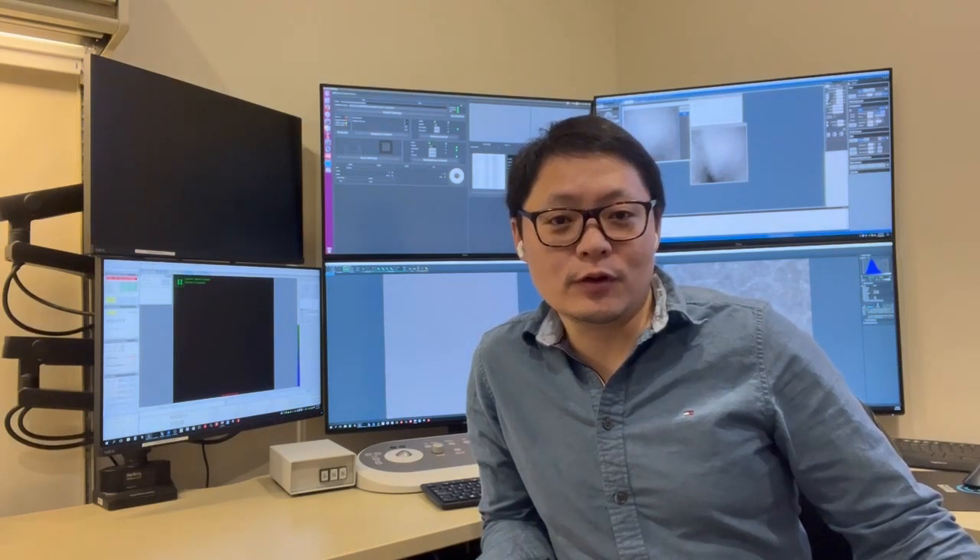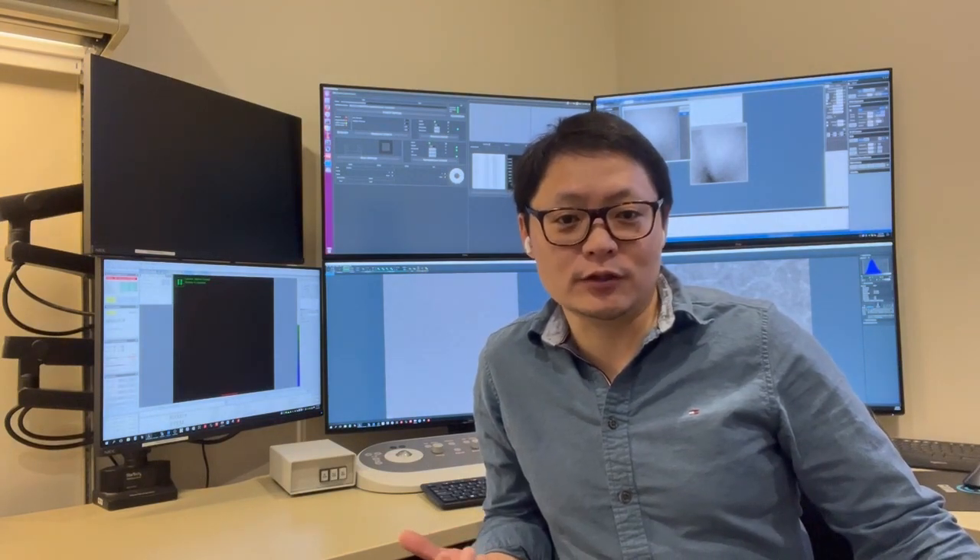Hi everybody, I'm Tao at MC Square of University of Michigan. In this tutorial I'm going to show you how to align the probe corrector on the Thermo Fisher Spectra 300.